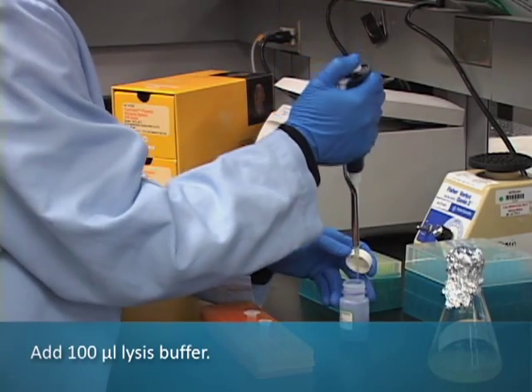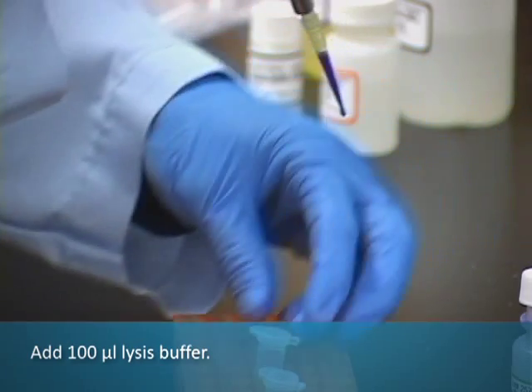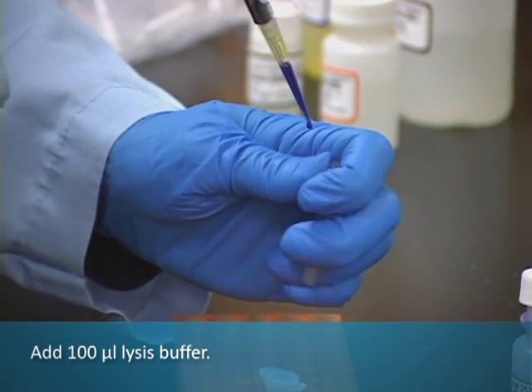To the 600 microliters of culture, add 100 microliters of blue cell lysis buffer, and mix by inverting.